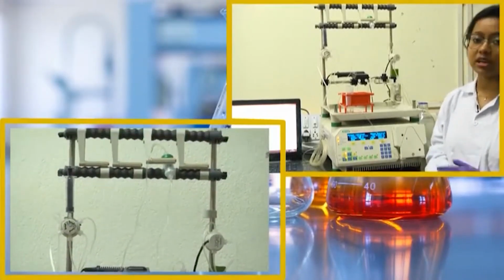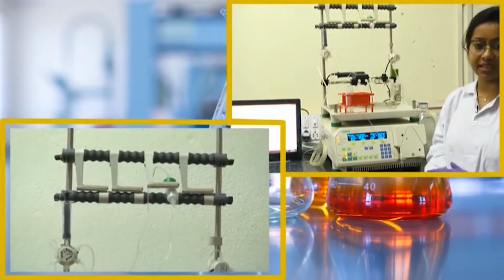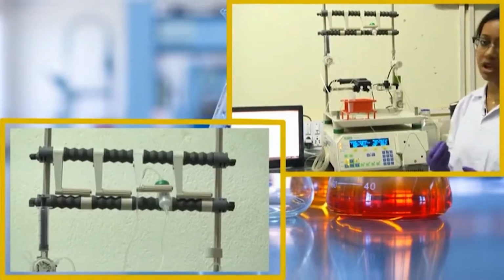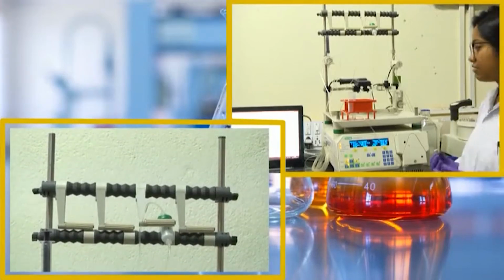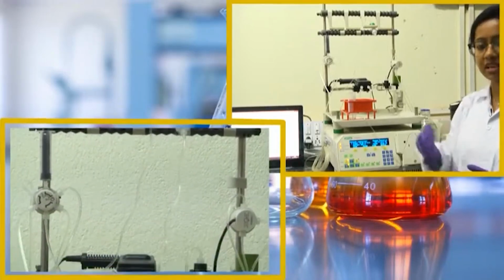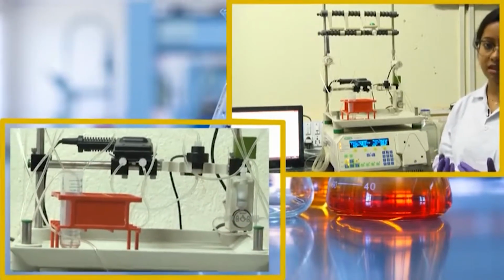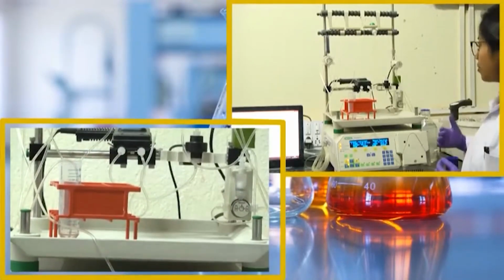We also have 10 millimolar imidazole inside the wash buffer, or buffer A, that will ensure that non-specific binding does not happen. This particular procedure has been mentioned in the chromatography lab. Basically, a small amount of imidazole, which is another binding partner or ligand for the nickel ions, will inhibit any non-specific binding. Another protein might also have histidine moieties which might bind to this column, but the imidazole will hamper that kind of binding. Since our protein has a long consecutive histidine-rich tag, it will get bound to the column and other proteins will come out from the column.